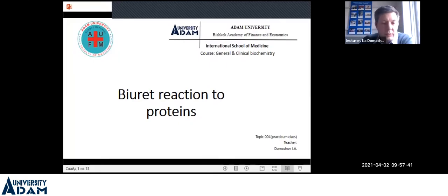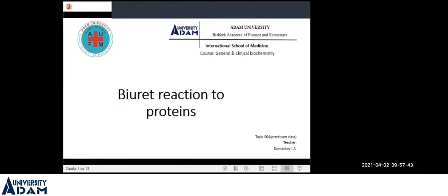The Biuret reaction, and of course we will spend some time also talking about a little bit other types of reactions for recognizing, for example, proteins in the solution, in the samples. But also we plan to talk about the Biuret reaction.